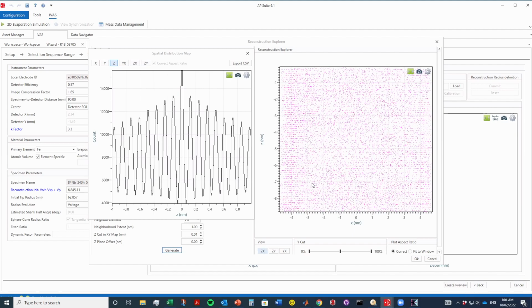You're able to capture your whole tip or very close to your whole tip, and see things like FinFETs much easier. And yeah, heaps of reasons. One of the things that I'm interested in, of course, is that we're going to get more zone lines and pole information. That should make machine learning methods of indexing easier, and give a bit more confidence in indexing the patterns. So yeah, I'm looking forward to that.